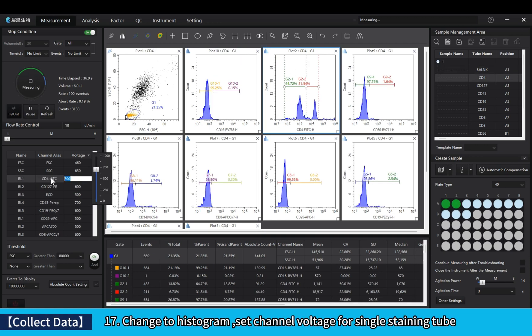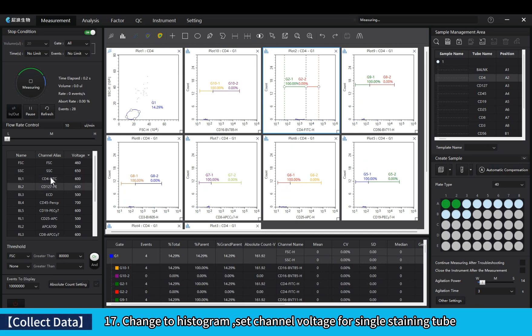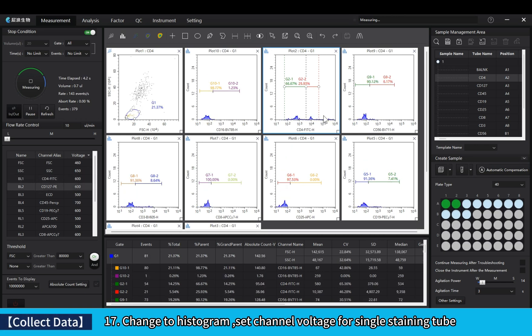Change to histogram. Set channel voltage for single staining tube.